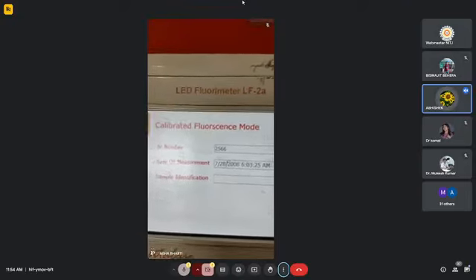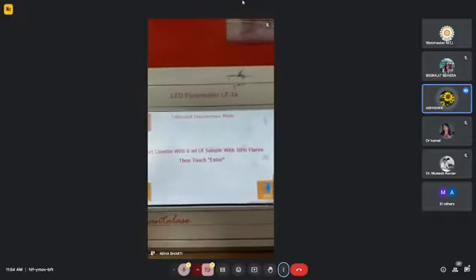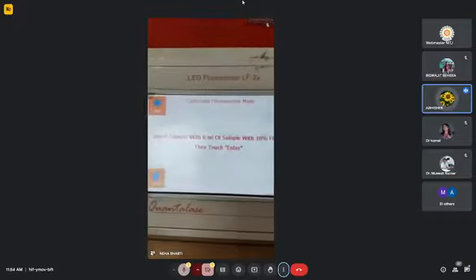Now we are ready to calculate uranium concentration in any sample which has an unknown concentration of uranium. For that purpose, again we need 6 ml of water sample of unknown uranium concentration, in which we will add 0.6 ml of the buffer solution.